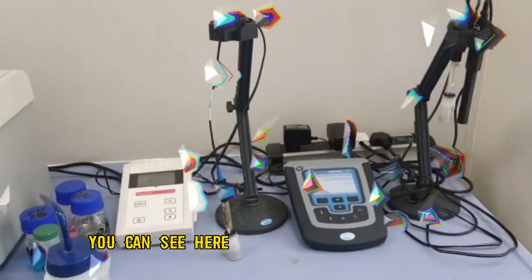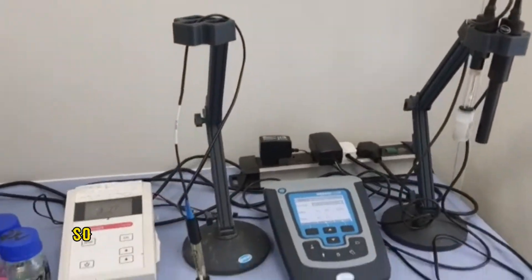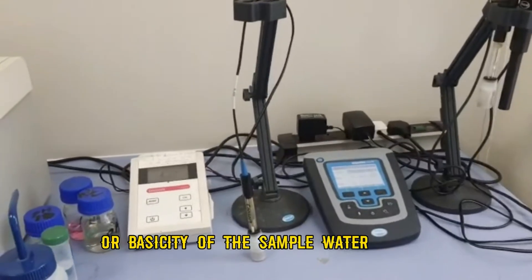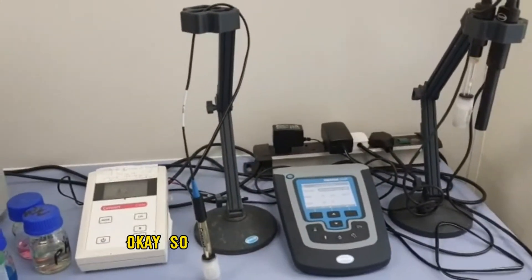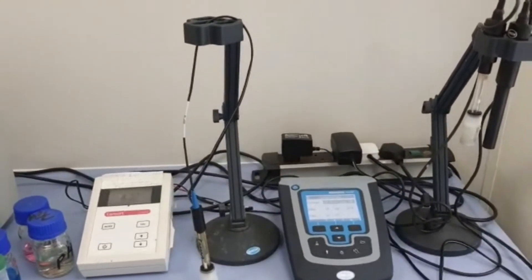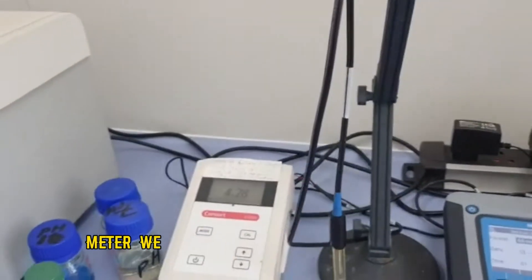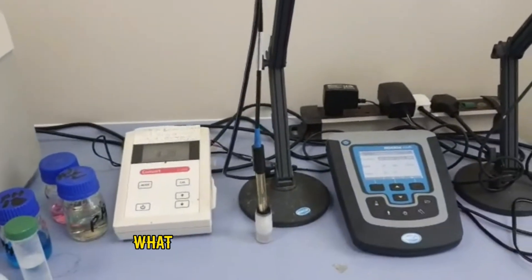Hello friends, you can see here that we have a pH meter. Normally, pH is going to tell you what is the acidity or basicity of a water sample. Before going into detail about the pH meter, we should know what a pH meter is, what it does, and how it works.